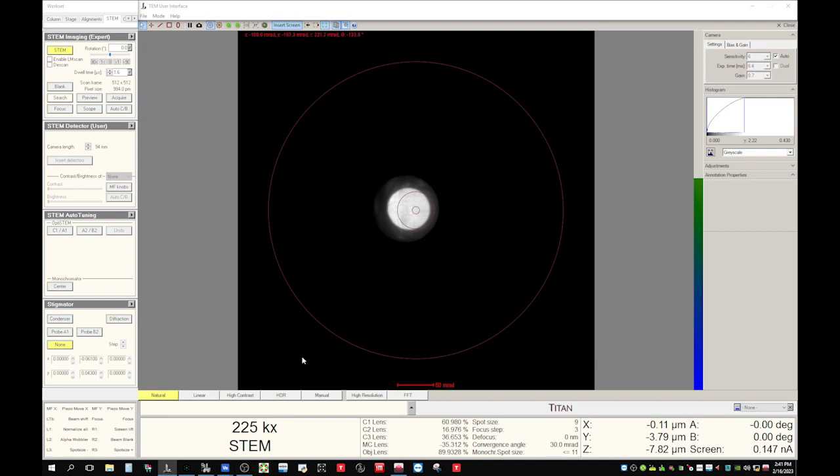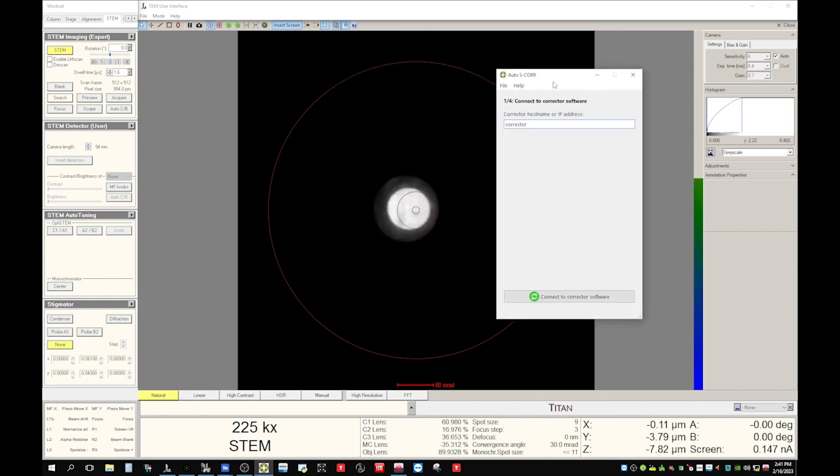Now let's turn on the auto alignment software. Click it and it appears — I dragged it here. This is how the software looks if it's open for the first time. You don't have to change anything, just click 'Connect to the corrector software'. Now click 'Import' again — it will try to find the probe semi-aperture, which is the convergence angle. We are using about 150 pico amps probe current. You don't have to change this number, because putting a smaller number here causes the software to push its limit to really get a better alignment.